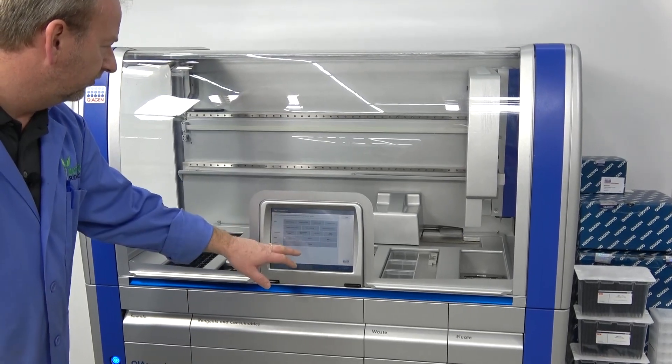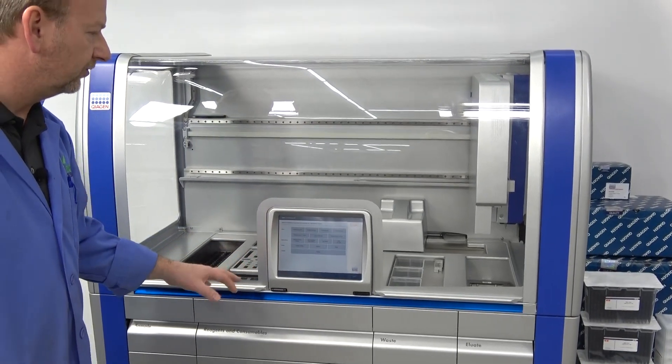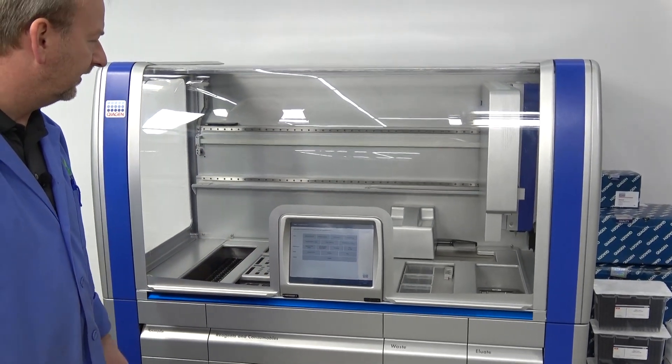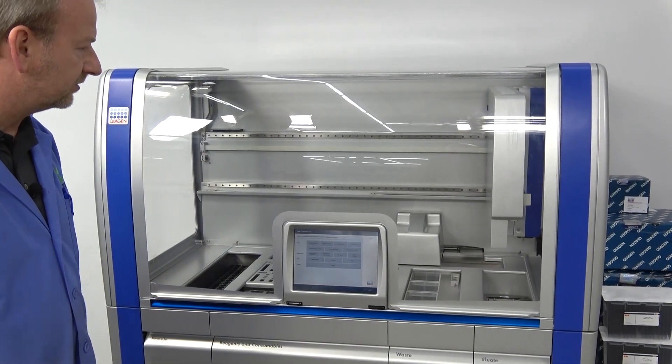We could also go through some of the other components like the piercing devices, but all this has actually been gone through during initialization and everything passed. So we just wanted to do a quick demonstration.